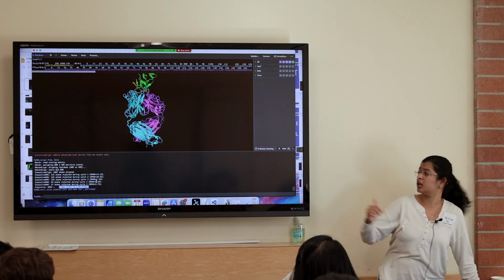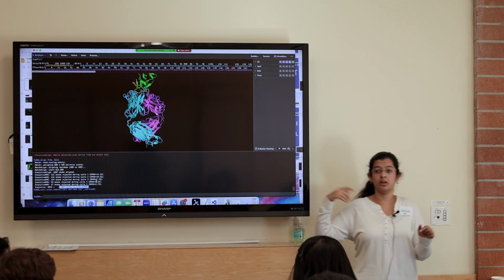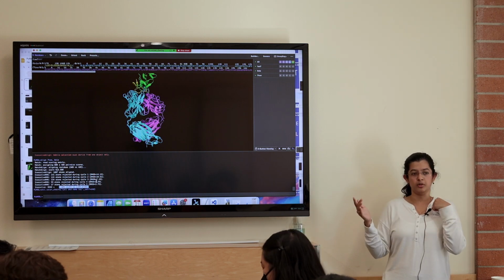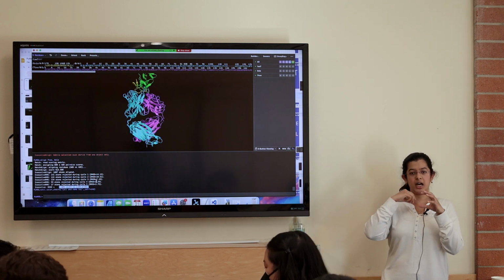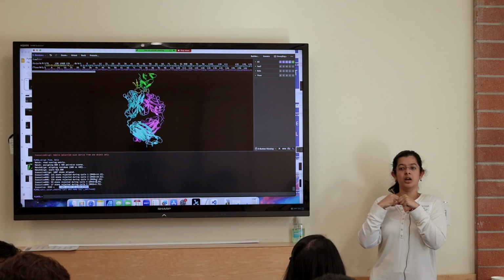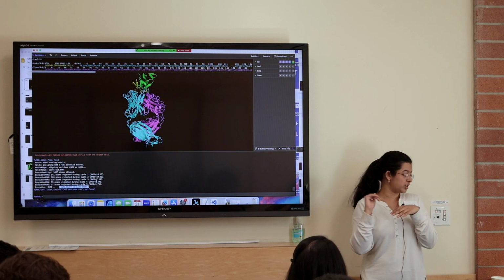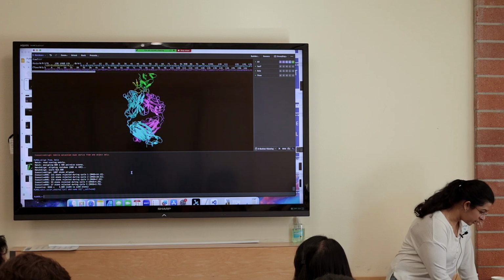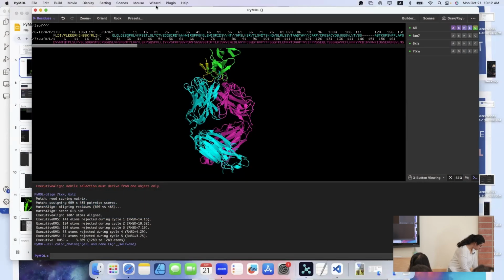And it's over all of the atoms, so the numbers are probably going to be different from what you see when you use other tools, because other tools might just look at the alpha carbon of each of the residues, or just the backbone atoms, not including the hydrogens and stuff. So those are the simplest behind-the-scenes ones.